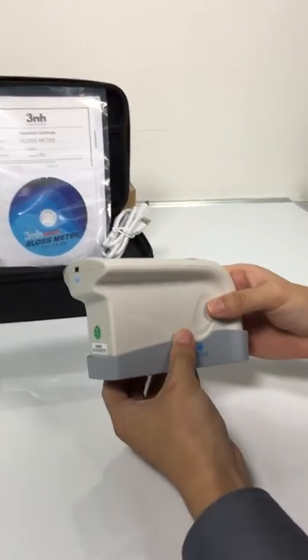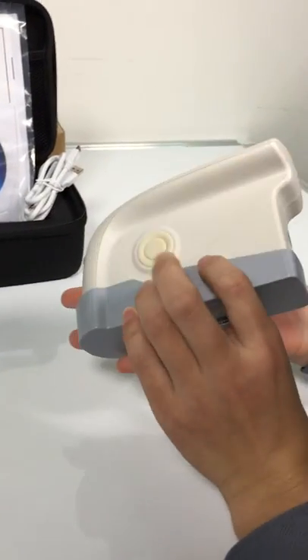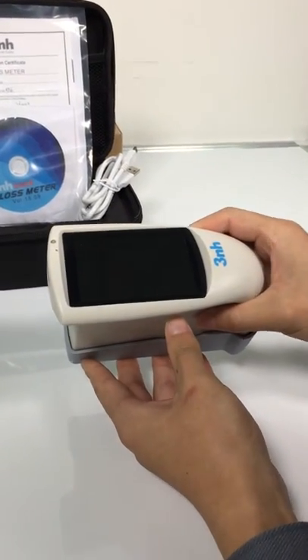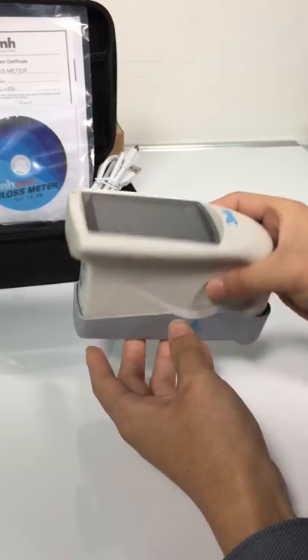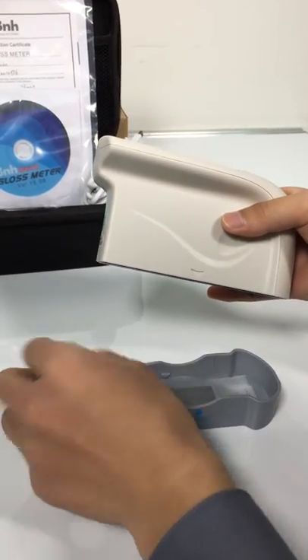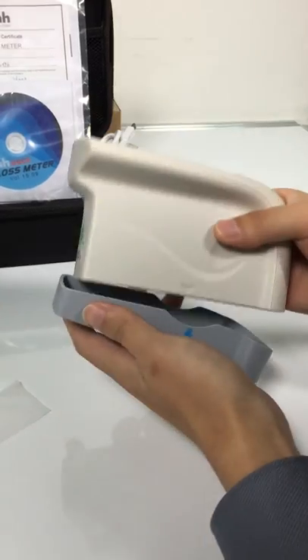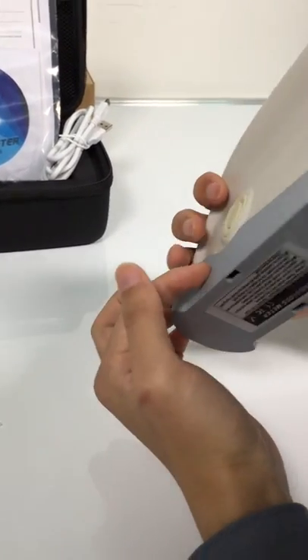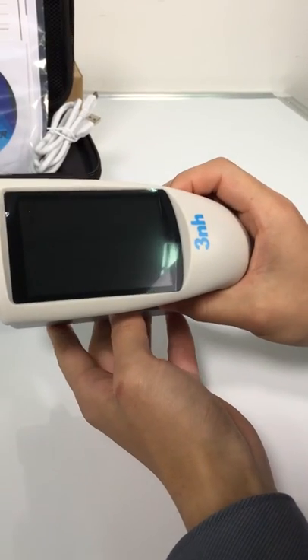This is a Glossometer HG60. It has auto calibration when it's turning on. So first we do calibration. Press the mirror button for three seconds to turn it on.